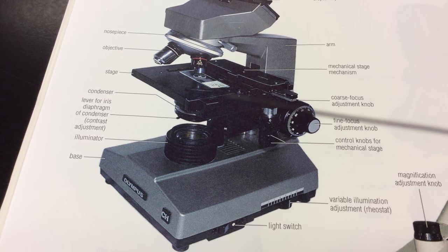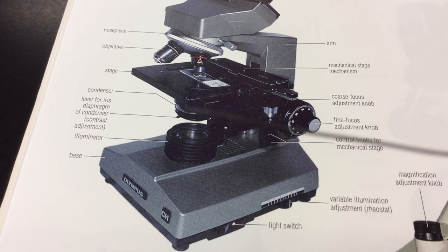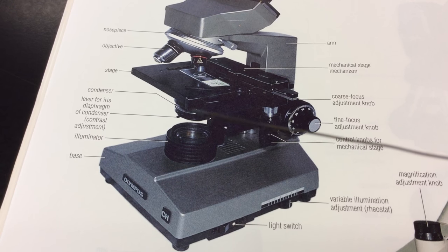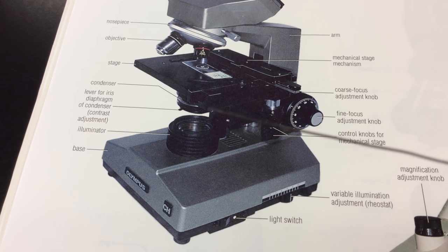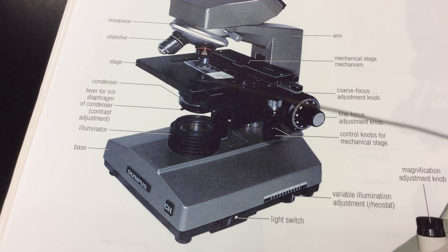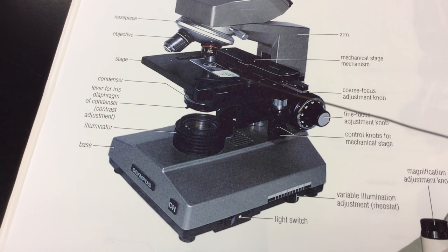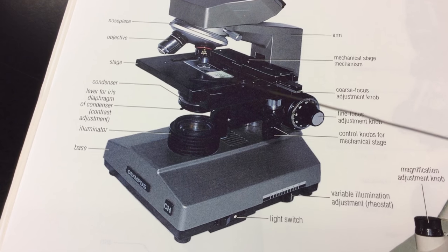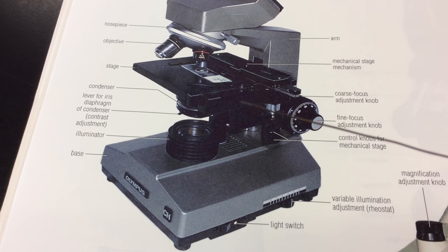As we mentioned, another structure below the stage, here is a series of lenses that are going to help to focus the light onto our specimen. This is called the substage, meaning below the stage, condenser. So the substage condenser, again, is a series of lenses that will help focus the light on the specimen. That's going to help increase the resolution, the clarity of the outline of our specimen. So usually when we're looking at bacteria, we want the substage condenser raised, elevated as far as possible to focus a maximum amount of light on our specimen.